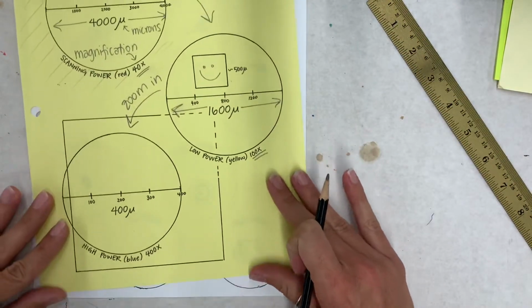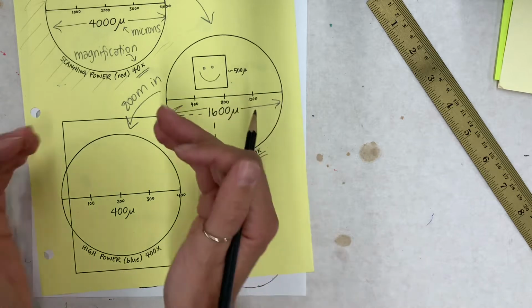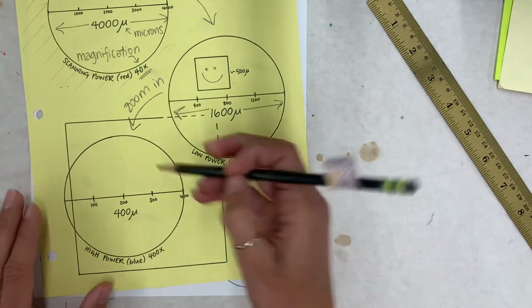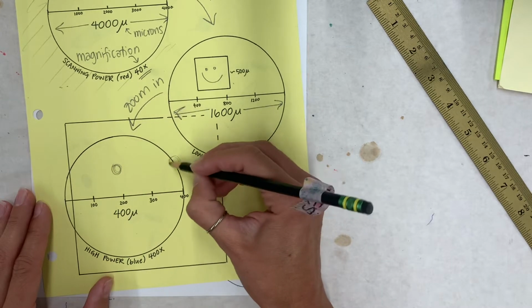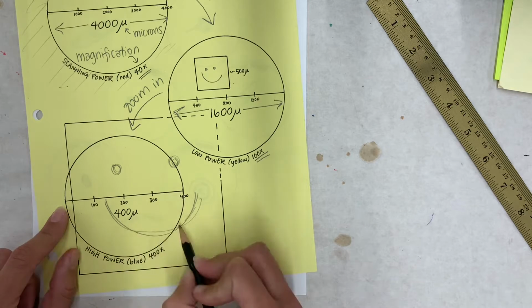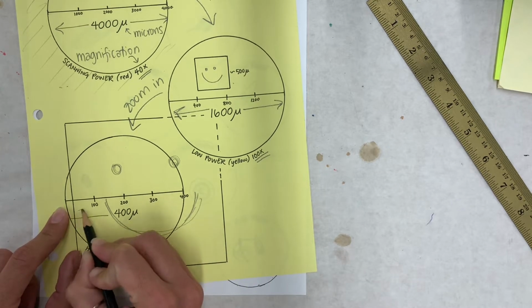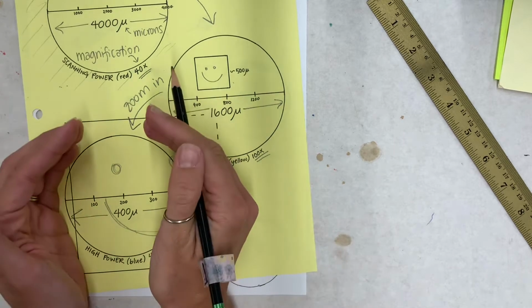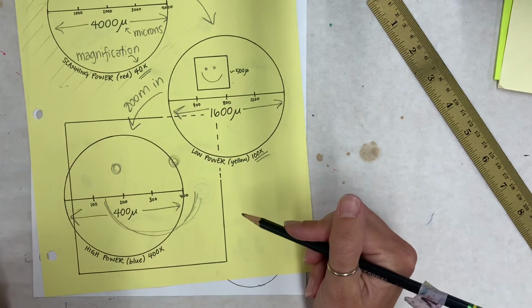Take a look at our specimen now. Our specimen takes up more than our field of view. So normally we would just see what's in the circle here, and we would be getting a closer look at this specimen. In this case, because our field of view is only 400 microns across, we're only seeing a portion of our full specimen here.